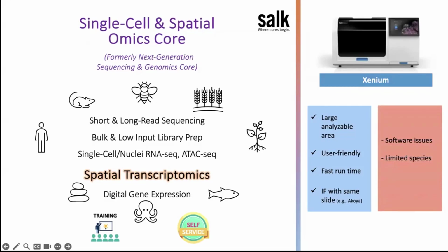We have noticed that we got some software issues, and also the panel that 10x Genomics is currently offering has limited species. If you have a certain species, you need to work with 10x Genomics and basically create a custom assay with them. But we hope soon 10x Genomics is going to offer more choices.